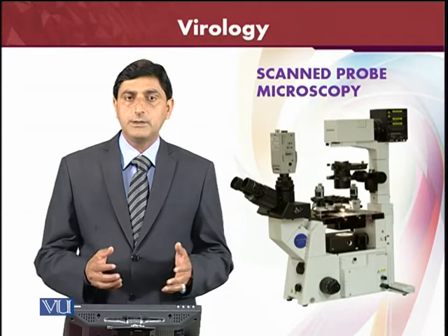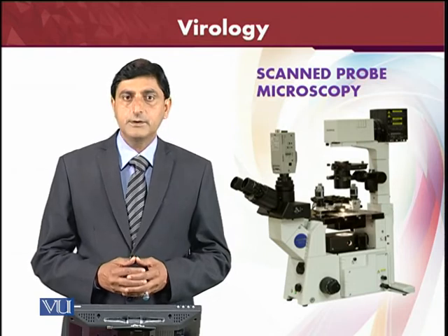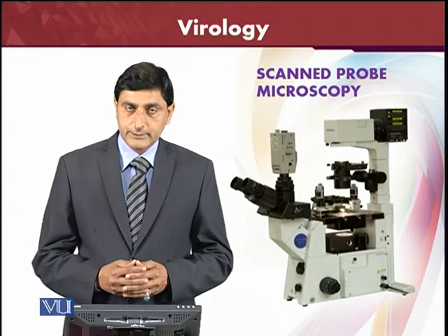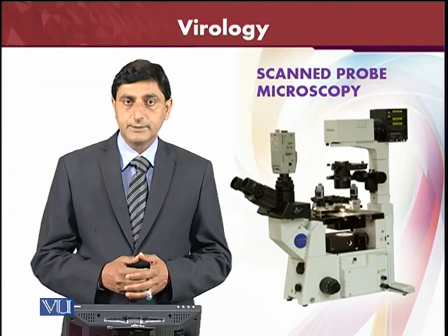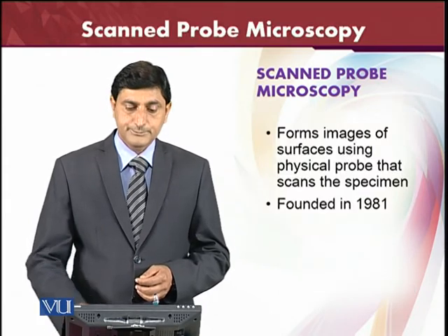Until now, among all the microscopes we have studied, the electron microscope was the best one, and we were able to examine really ultra thin objects and see them very nicely. Now the most important is scanned probe microscopy, a very complex kind of microscope.